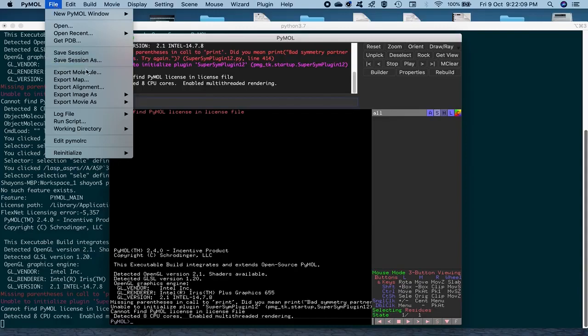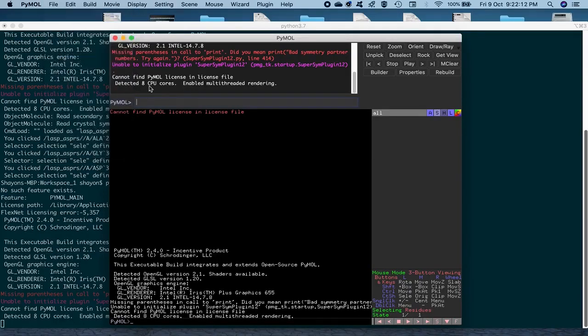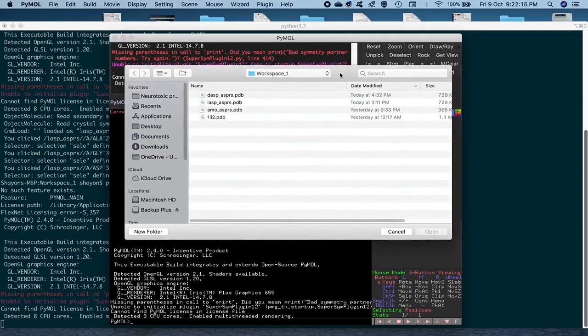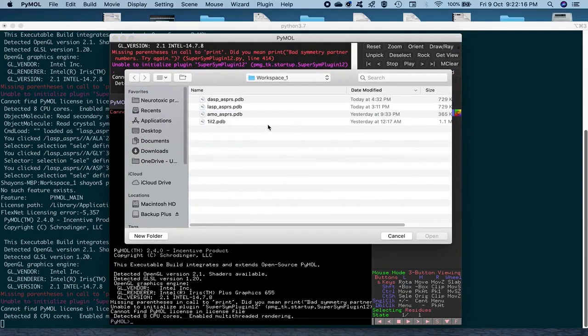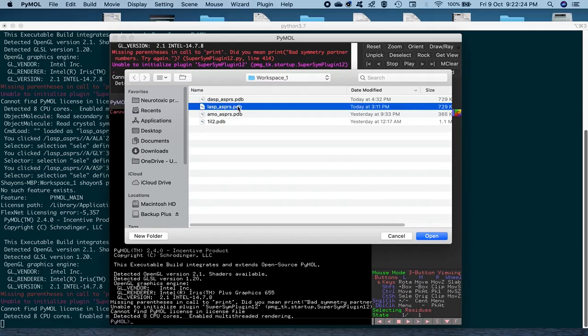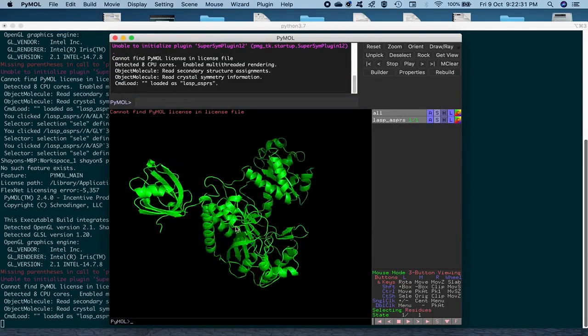So the first thing that we'll do is just load up the structure that we have already saved by Chimera in the last session. So what we do is go to File and open the structure. And as you can see, I'm already in Workspace 1. So I'm just going to select L-asp bound to ASPRS. We also have the D-asp bound to ASPRS that we created by Chimera by inverting the stereo isomer.